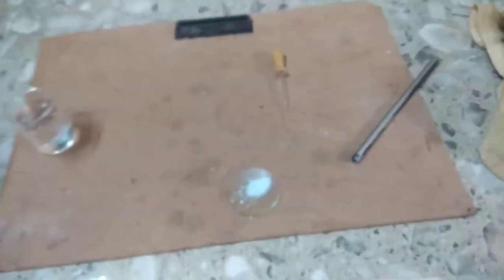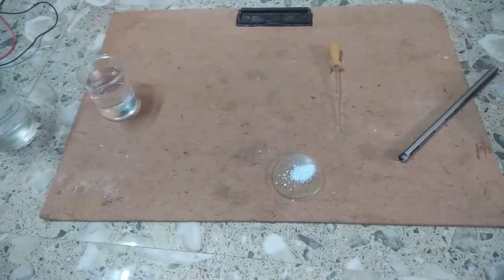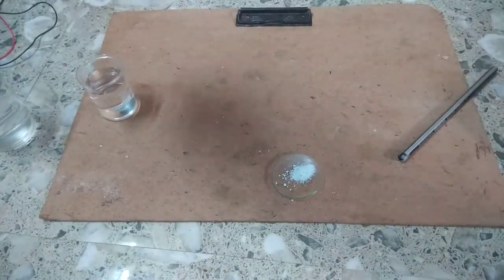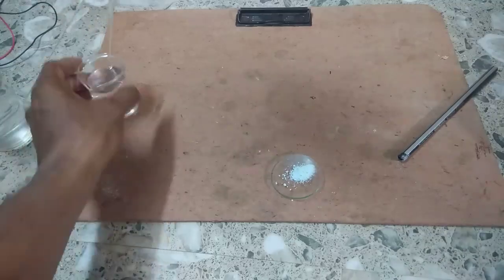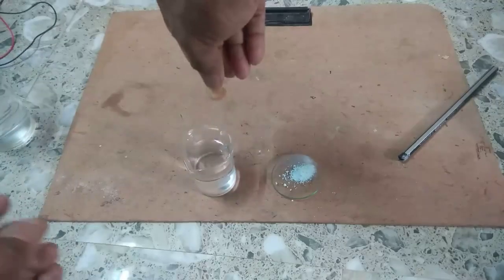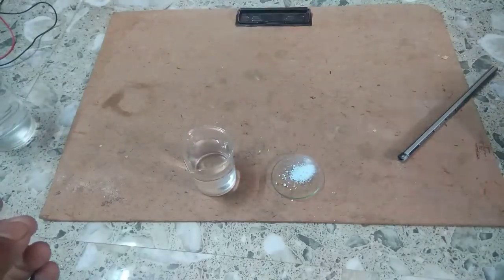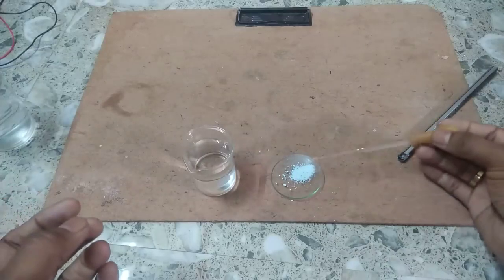Now let us see, if we put water to this white copper sulfate, what happens then? Let us take water and put it. Here we have taken water and if I put this water in this, let's see what happens.